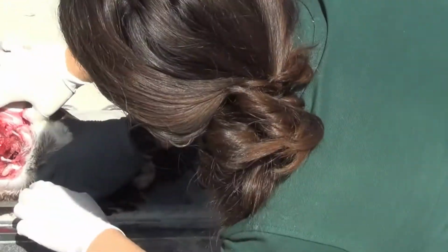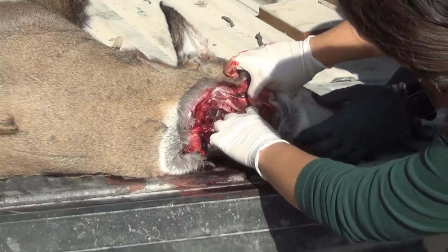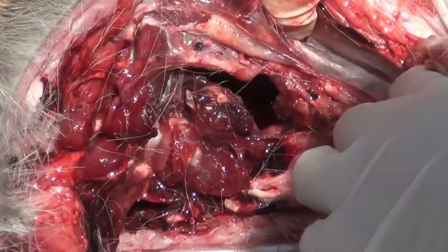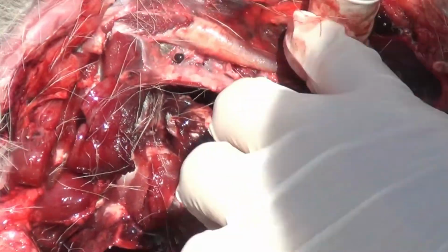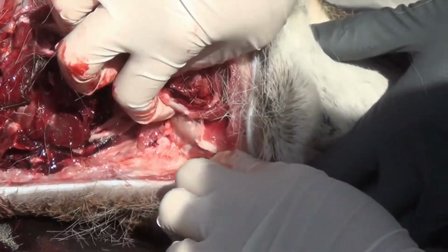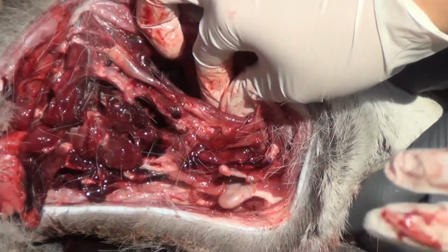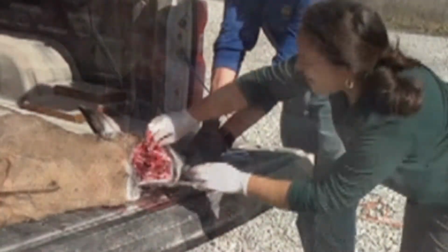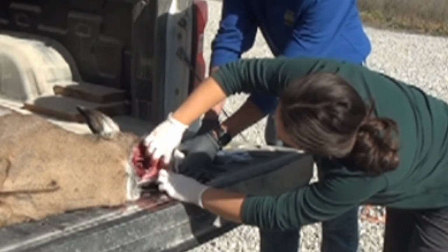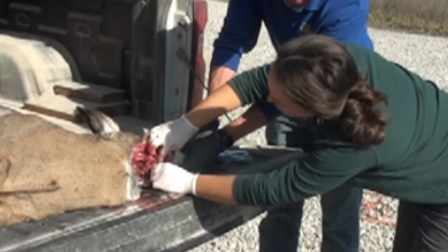But if we take a look around and kind of tease through some of this tissue on the other side, sometimes it's really obvious, sometimes it's going to take a little bit of orientation. So even for us, and we're kind of the experts here, right? And you'll see that there are other smaller lymph nodes.